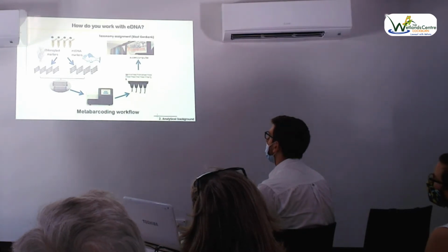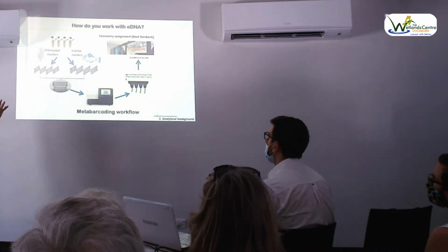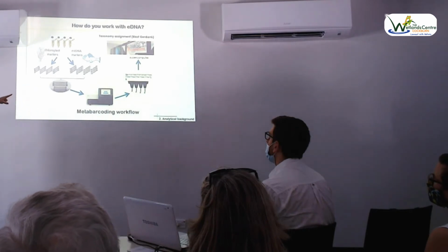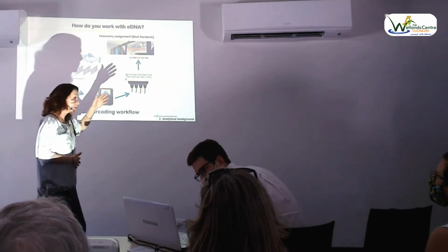What we do is put on these magic license plates, so to speak, that we stick on the ends of the DNA that are coded to that sample. We run it through the high throughput sequencer, which can generate anywhere from 1 million to 100 million sequences.